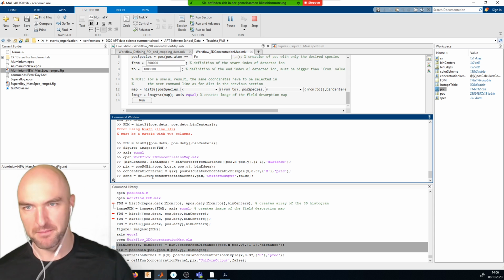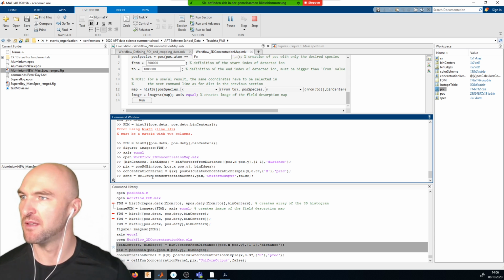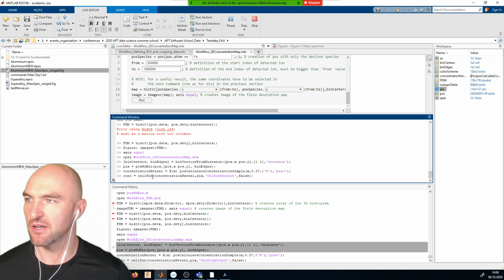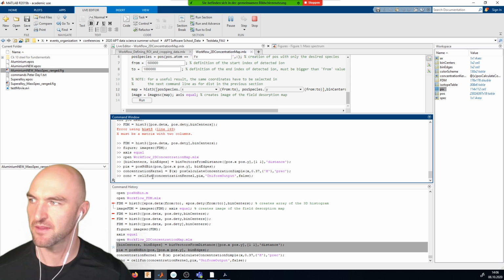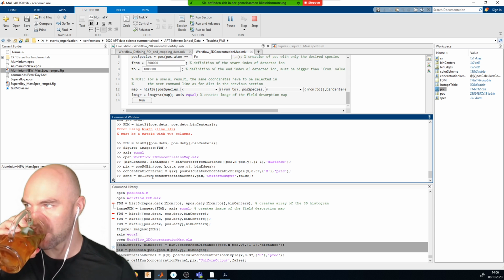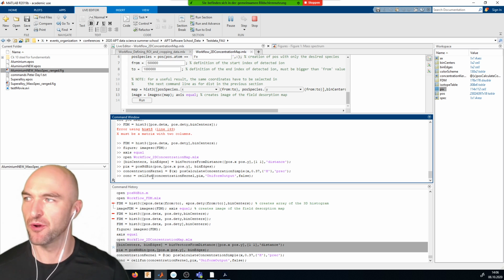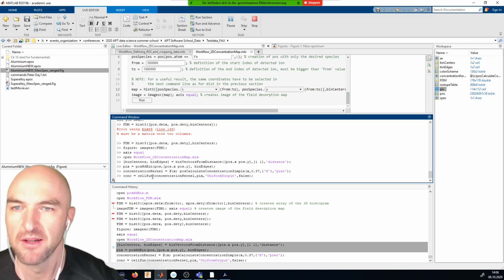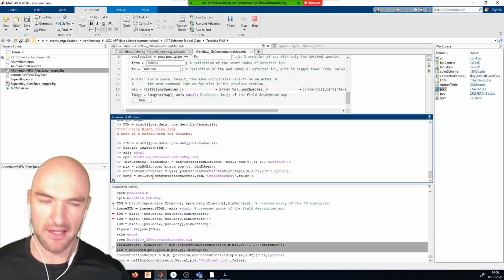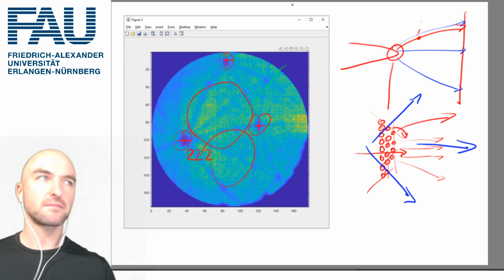And this is what I meant by we need better concentration kernels, because now, do you apply any delocalization in your binning? No, because you can't delocalize individual atoms. So there's no delocalization in there. So delocalization really only works if you, so maybe while it's calculating, I just explain to you what ND means.